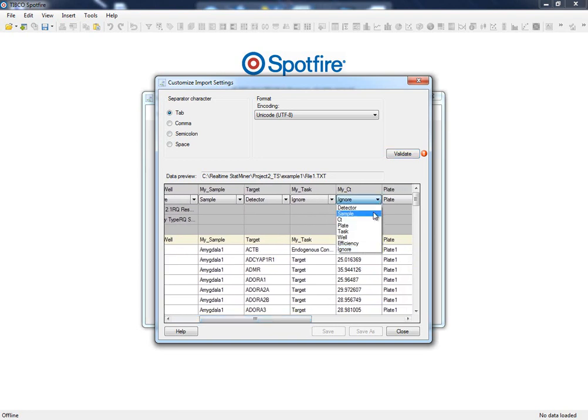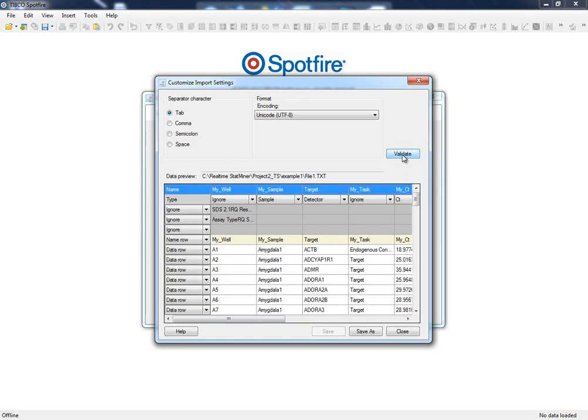Now that we have specified our three mandatory columns, namely sample, detector and CTs, our data can be read and we can continue with the analysis. There is, however, still some information in these input files that, although not mandatory, can still be useful for the analysis.